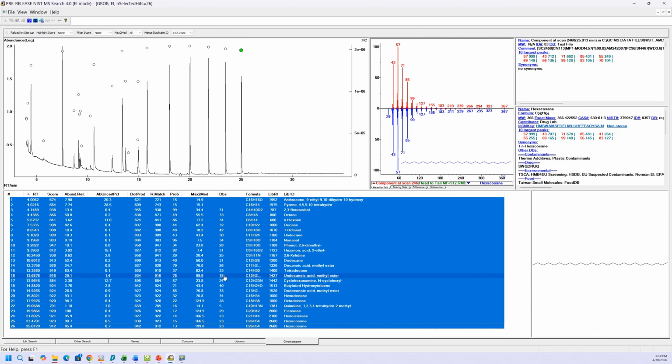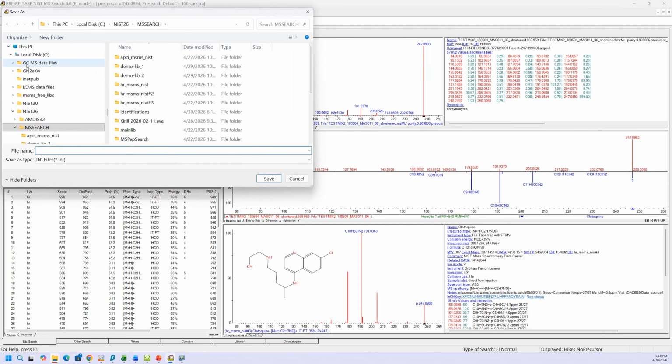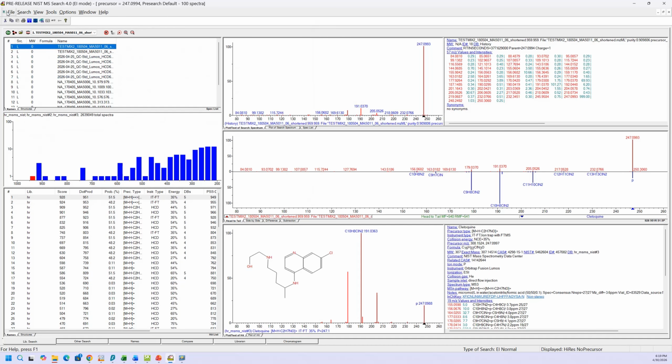After you get all these things set up the way you want to, you need to go to a different window besides Chromatogram because Chromatogram does not let you save the configuration. And that can be very valuable after you get everything set up like you want so you don't have to start from scratch everything. So click on another window such as lib search. I click the tab at the bottom of your screen. I come up and I say File, Save Configuration. And so it'll save it in a configuration file for me, and I'll put in whatever I want to call it and say Save. After I get through, it'll show up as one of the ones that I can restore a configuration. And plus, there'll be a couple of configurations that NIST has probably included with the software.